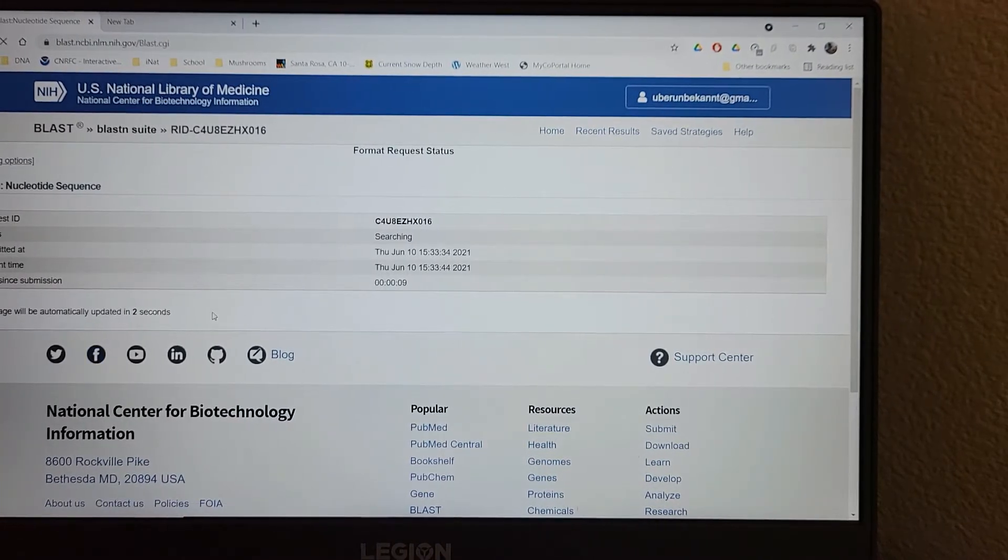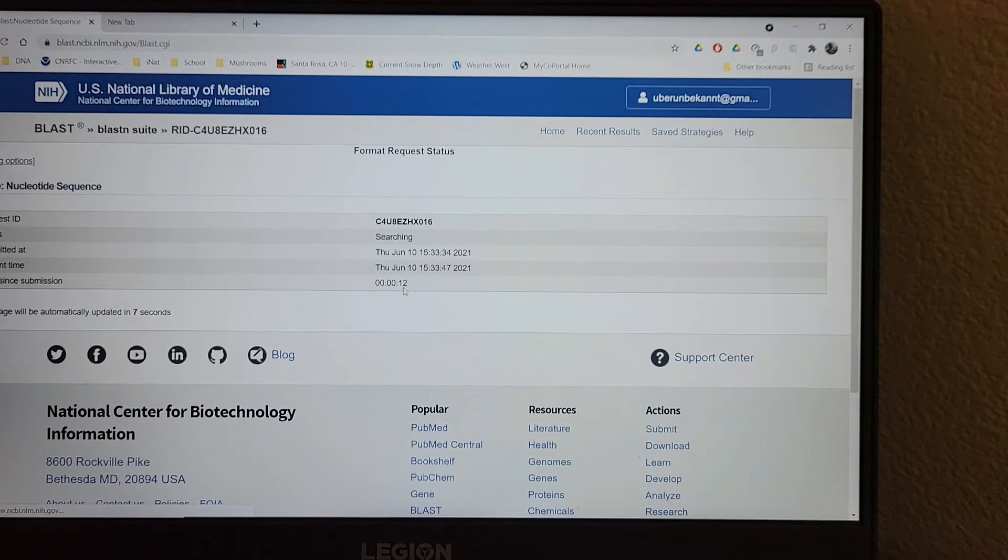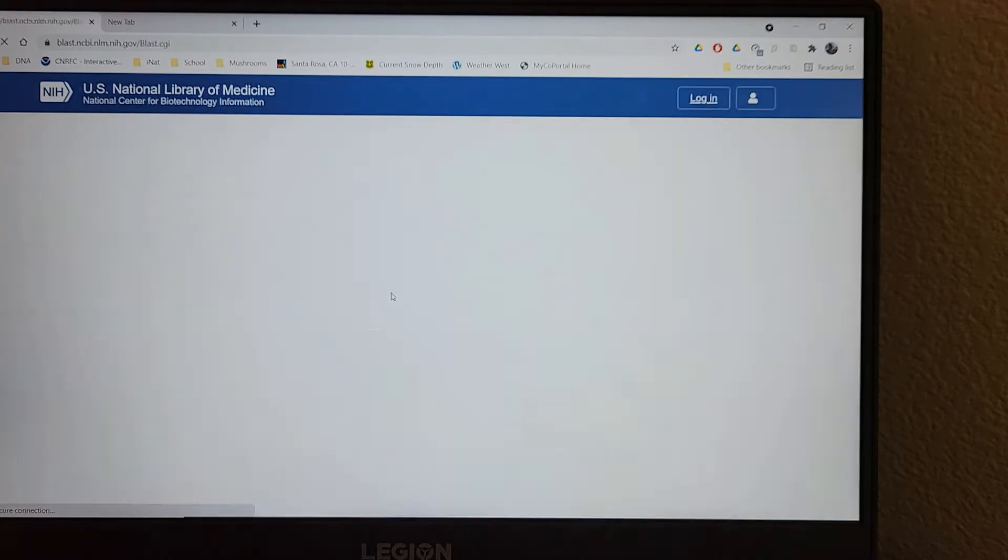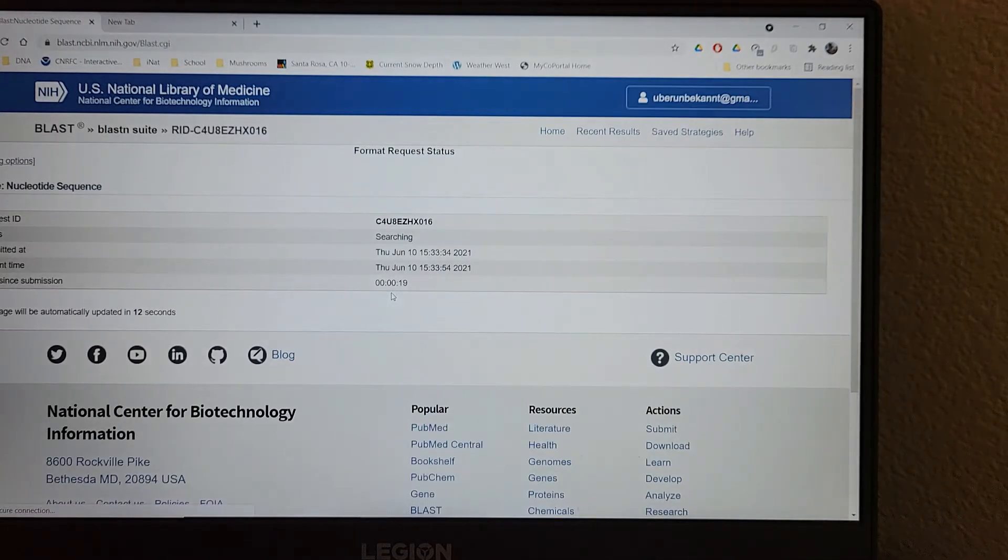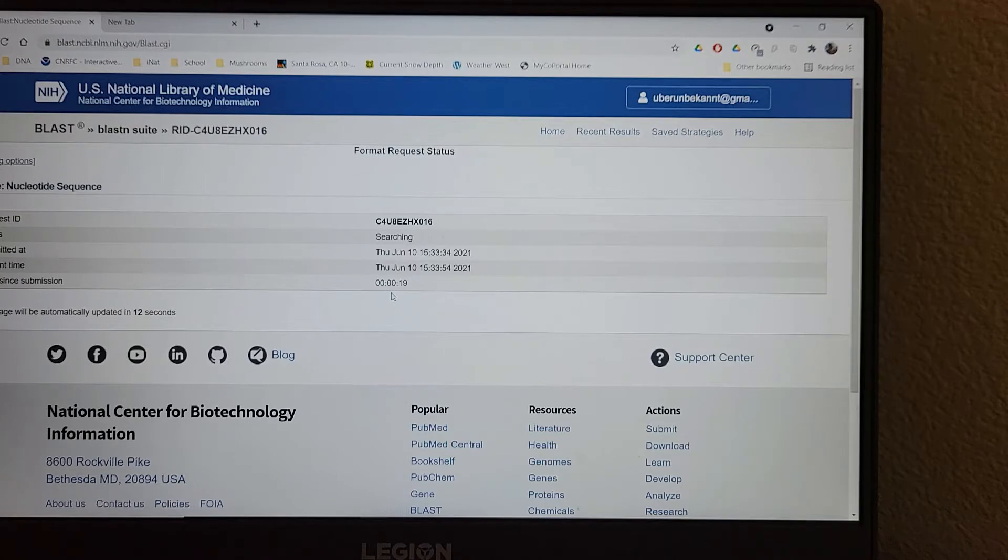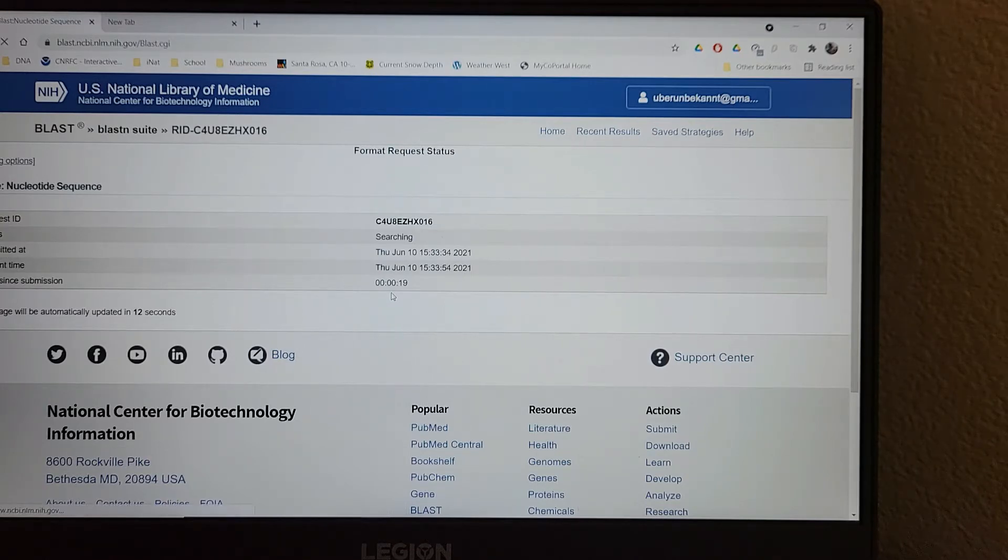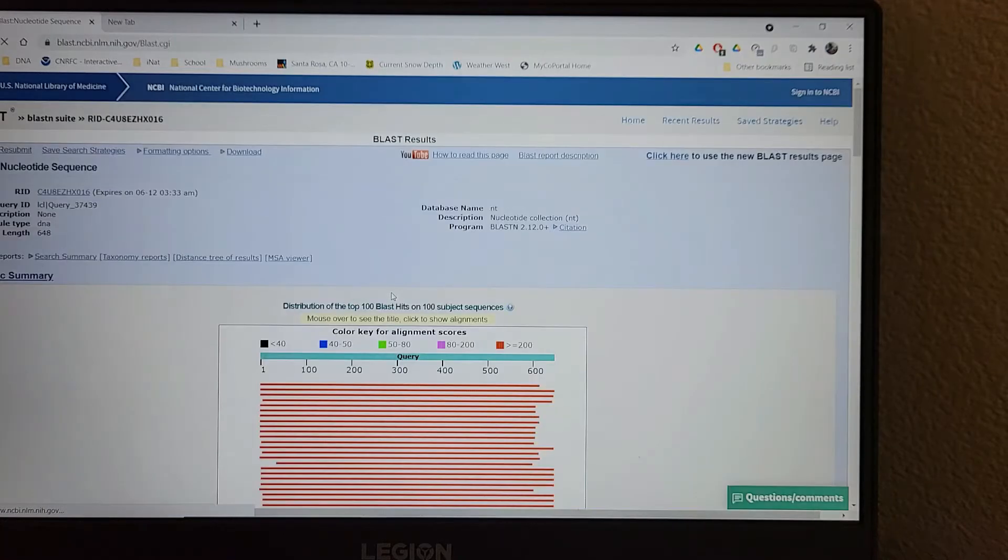So I'm going to watch this number. Sometimes it takes a while. I've had it take minutes. I hope it really doesn't take minutes today. There we go.